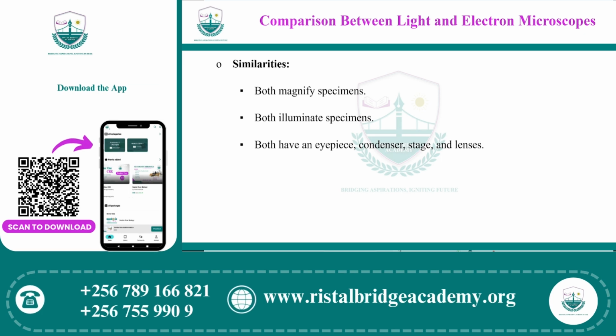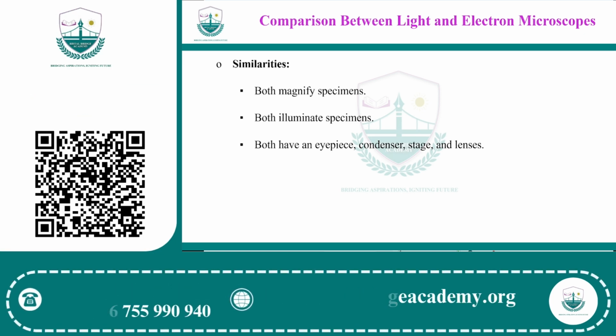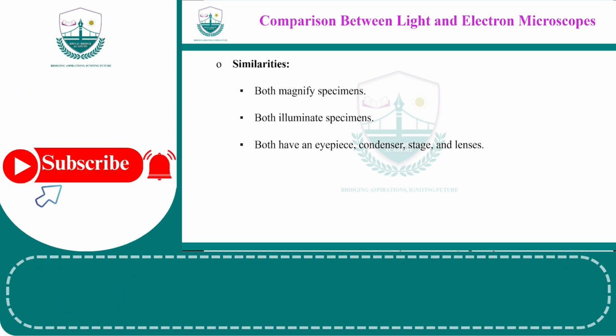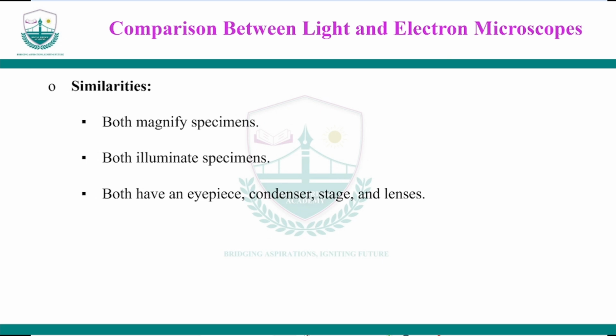Despite their differences, they share some similarities. Both are used to magnify specimens. Both use lenses and a stage to hold and manipulate samples. They both aim to illuminate and resolve fine details, although using different methods.